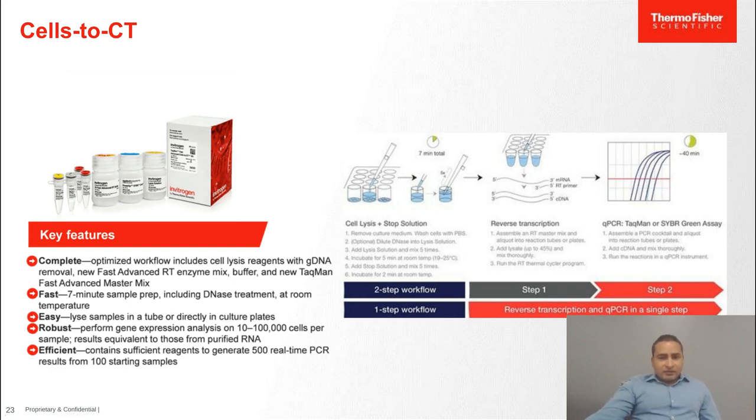So how you decide which workflow to choose depends on your research needs. You can choose 1-step if you have many samples with 1 or few targets, and if you do not like to store your cDNA. But you would probably prefer the 2-step workflow if you have multiple targets quantified from cDNA, need higher sensitivity for rare transcripts, and also want to archive your cDNA.